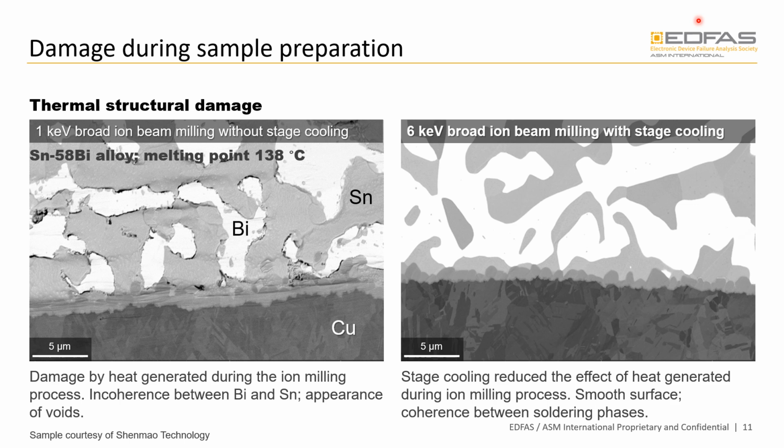As you can see in the second example, using higher energy with a cryostage minimizes the heat effect and no damage is observed on the sample.